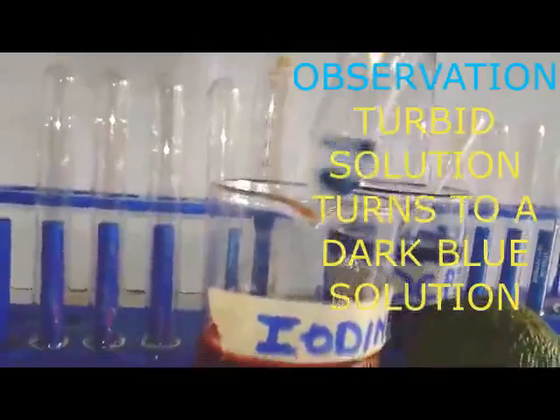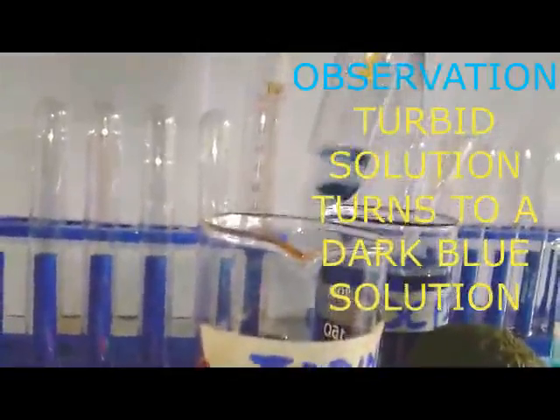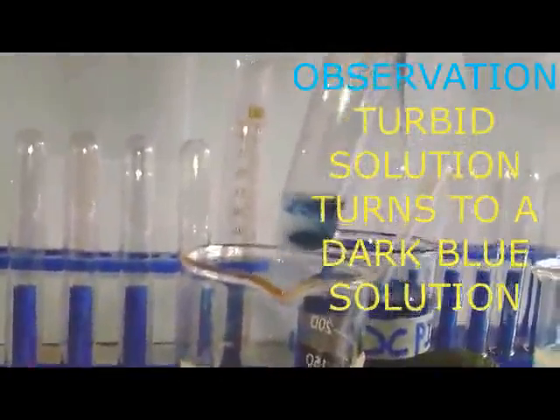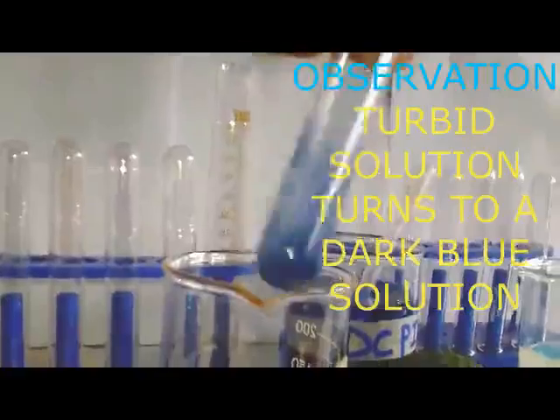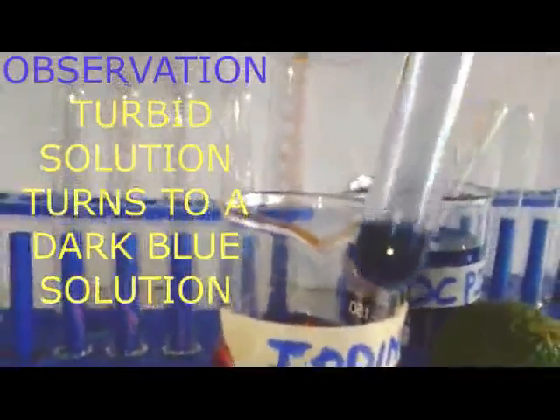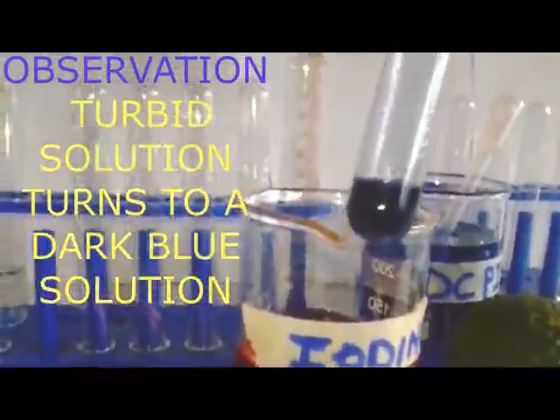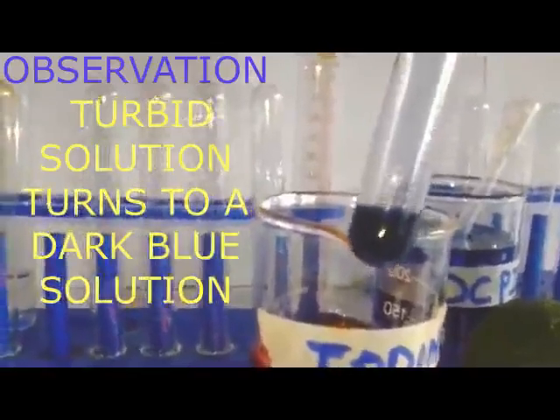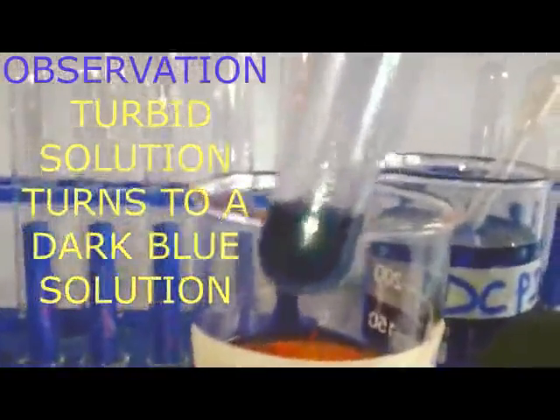Put 1, then we put 2. But before I even add, I shake a bit. You can see that my solution, which was turbid, is now turning darker blue. Or you can even say black. But avoid saying blue-black.